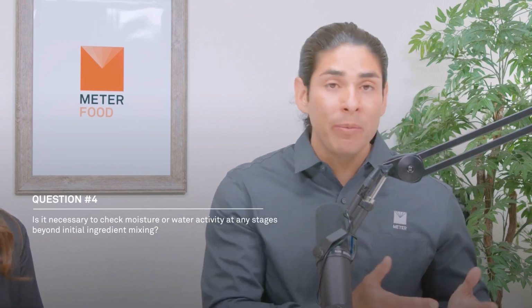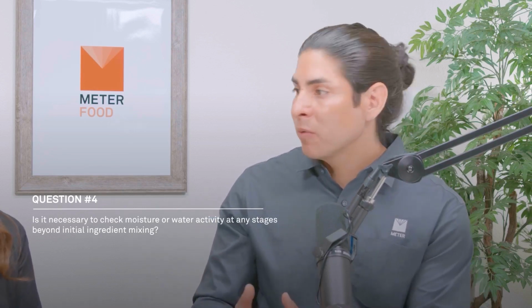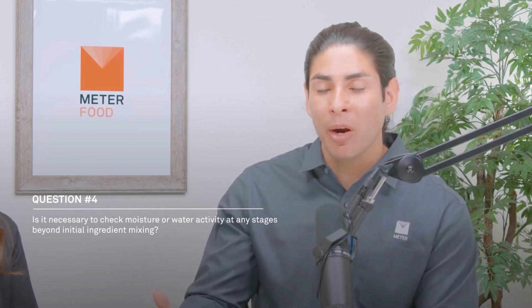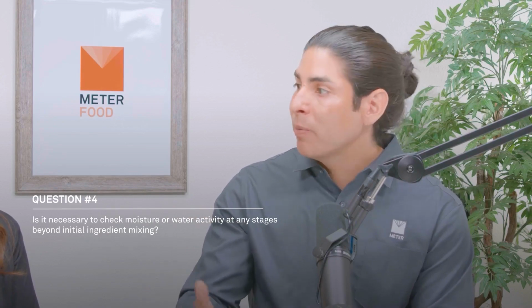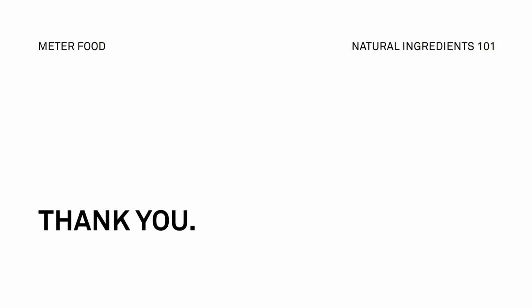So I recommend measuring your ingredients at the start, and measuring during production. We even have an inline solution now, so that you can always hit your target water activity. But then again, at the end, you should be measuring your final product right when you put it into packaging. And then we'll even see companies who do a shelf life study, who will measure water activity over time. So it's definitely something you want to monitor through the entire process. And by doing that, you can avoid recalls or any of these other issues that we've talked about today.